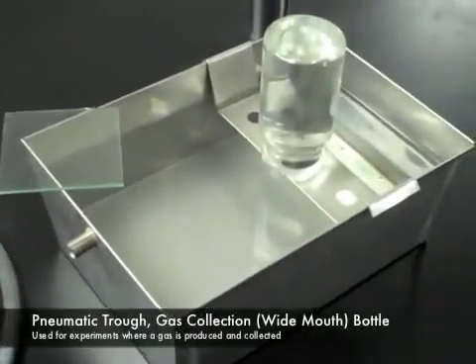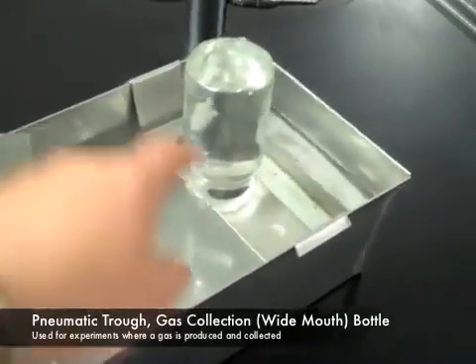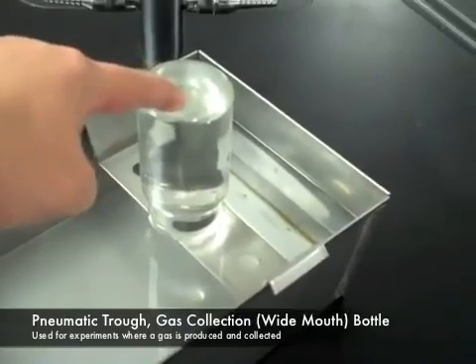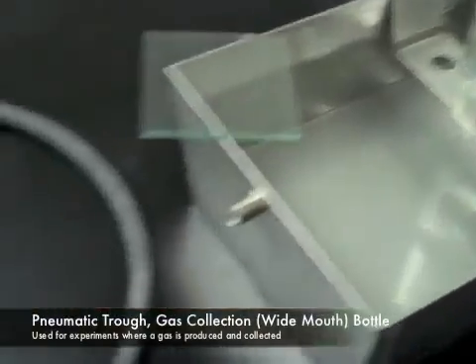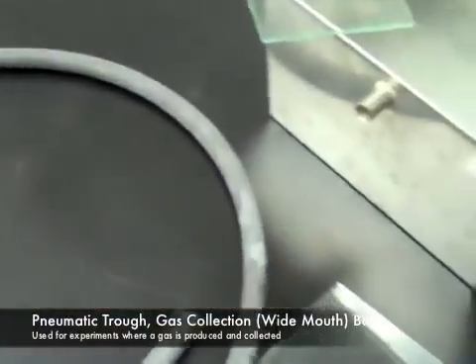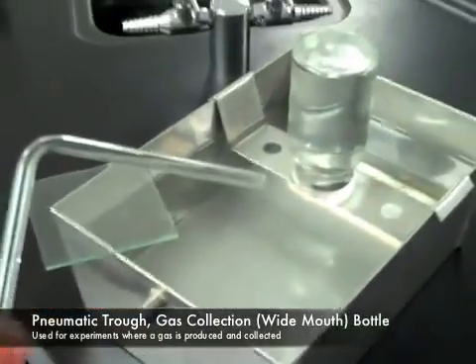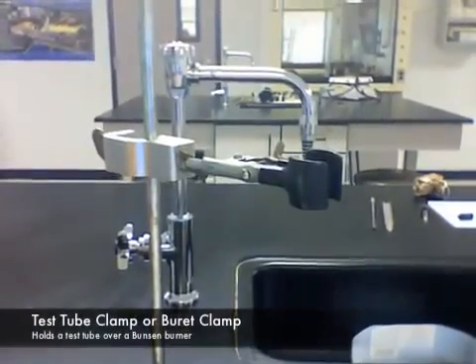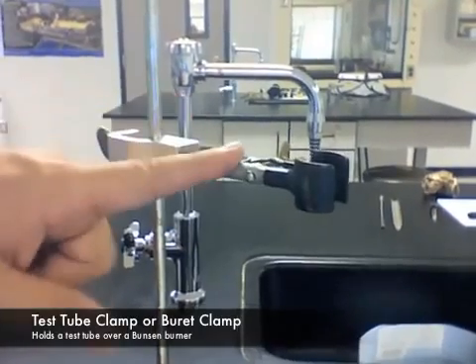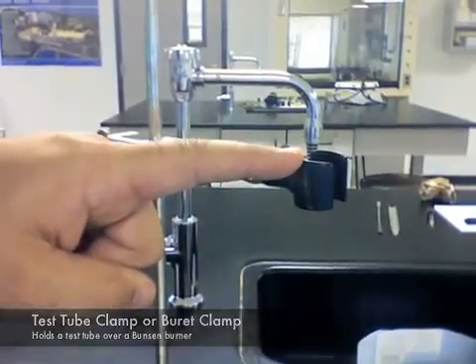The apparatus you see here is called a pneumatic trough. The pneumatic trough gets filled with water. There is a gas collection bottle or a wide mouth bottle, a glass plate that is used with the bottle, and there's usually also a hose and some bent glass tubing. These are things that you might use for a gas-producing lab experiment. Ring stands don't always just hold rings. Sometimes they hold test tube clamps. These will hold a test tube over something hot so it can be heated without you burning your hand.